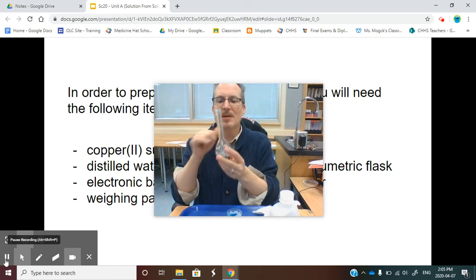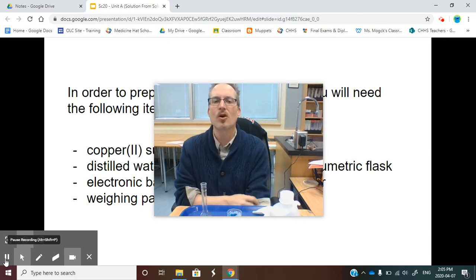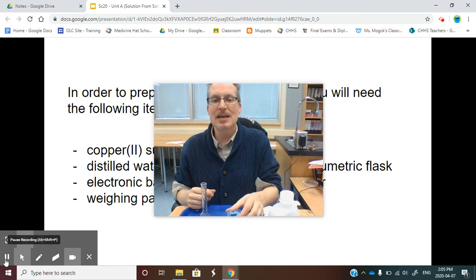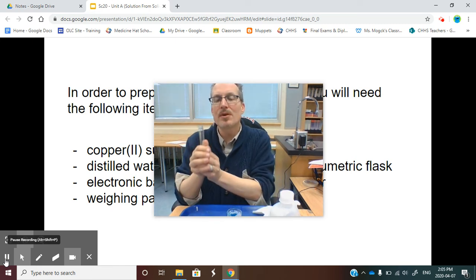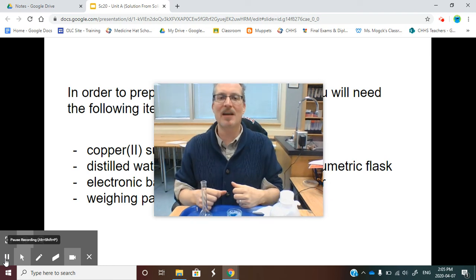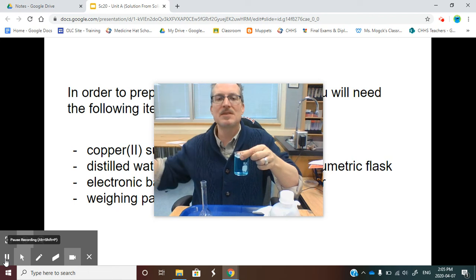There is no way for me to get every little droplet out of here. Kind of like when you have a drink of juice at home, you take a sip, there's always that one or two drops on the outside you can't get. Same thing here. We always make up more than we need. So I made up 100 mils because I probably only needed 85 mils. Now I can choose to take 85 mils or 50 mils out of this.